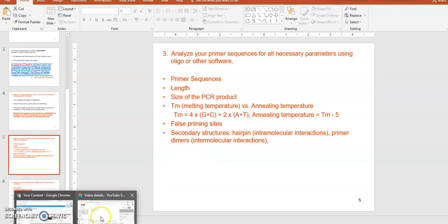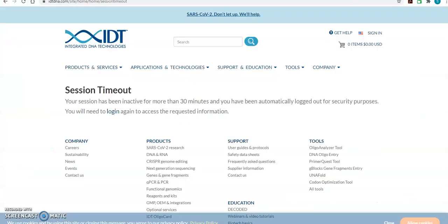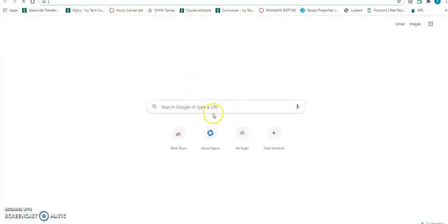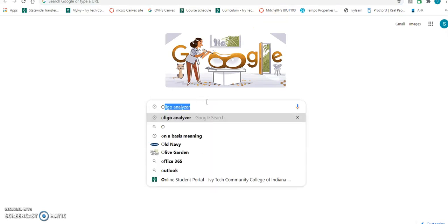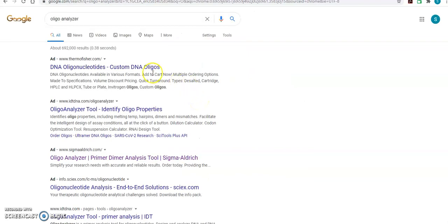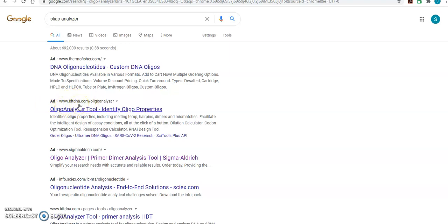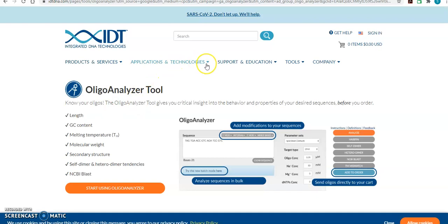Do a Google search for 'oligo analyzer' — for example, type 'oligo analyzer' and it will show you several options available on the internet. Out of these, I want you to use the one from IDT — Integrated DNA Technologies — the company that designs and manufactures custom primers. Click on the oligo analyzer tool from IDT.